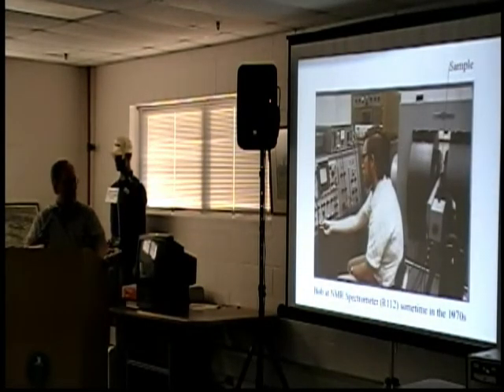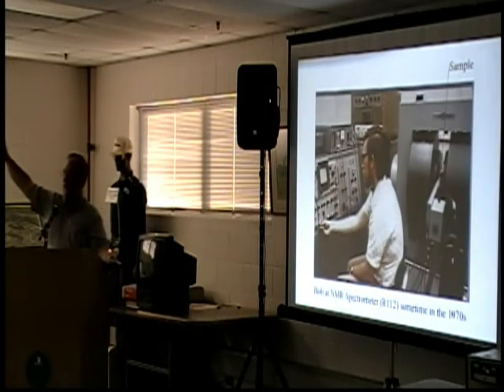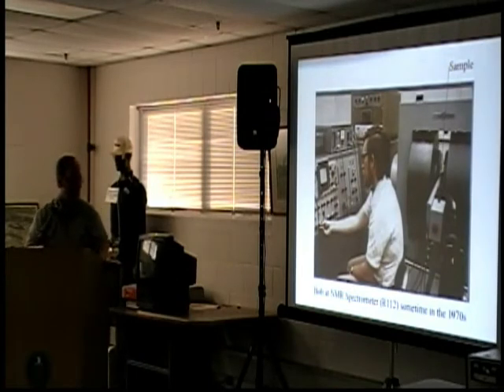Okay, here's a picture of me actually sitting at the spectrometer, and I sat at the spectrometer a lot. Kind of night and day, I think, for a time period. This shows the electromagnet. This is a sample in the middle of the magnet. There's the RF coils in there, and this is a tube for gassing to variable temperature. This is the oscilloscope, digital scope. We had a fast digitizer. It doesn't show the Polaroid camera. We take pictures. I'll show you a little bit of what we're doing there. There's a temperature controller. We had RF sources over here, and all these measurements were done in room R112 in the no longer existing R building next to the no longer existing SW building, this open space.